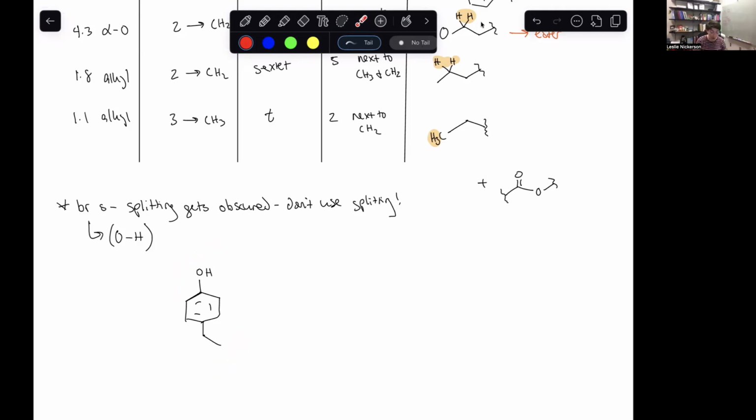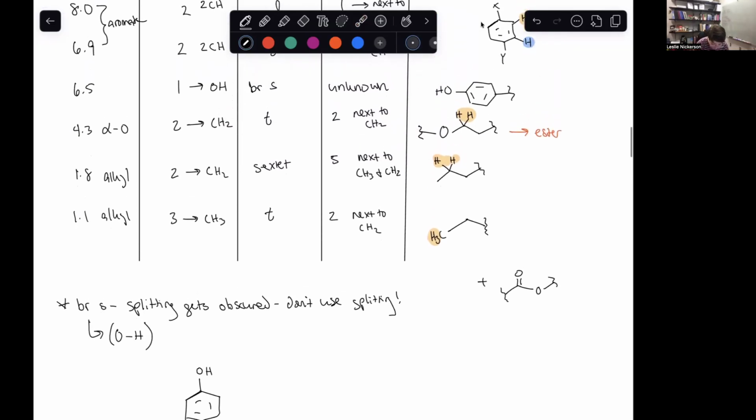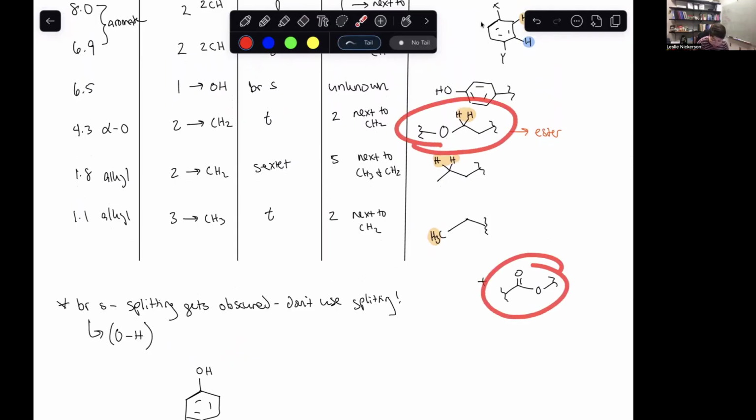So if I go in and put something down that only has the one connection point, I'm going to find myself at a dead end, basically, where I've blocked myself into a corner and I can't do anything to change it. So that's not very helpful. What we want to be thinking about is adding it to pieces that have more than one attachment point included in them still. In terms of fragments that I've got left that have two pieces, I've got this one and I've got this one.